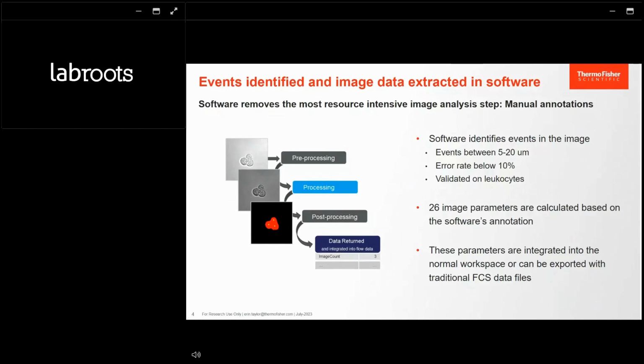This is pretty complicated the first time you hear it, and the important thing to take away here is you don't need to be an expert in image analysis to begin using this and to use it effectively. But these parameters do enable you to understand cell biology and understand your samples at a whole other level of complexity. And as you learn more and use these more, you can become more familiar with some of the other imaging techniques that are available if you choose to export this data and do your own additional image analysis in other software.